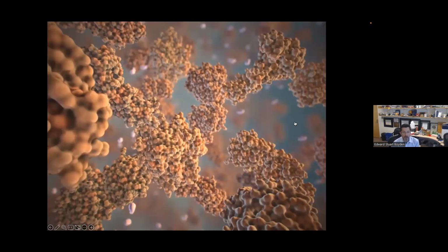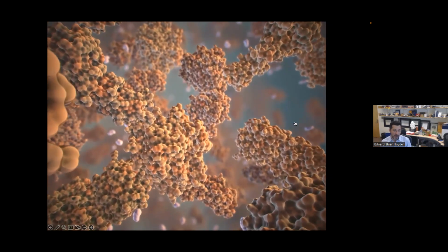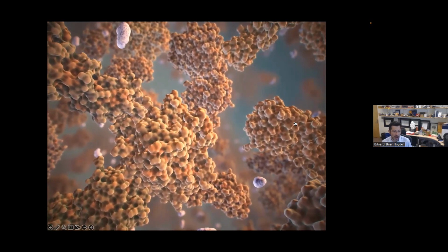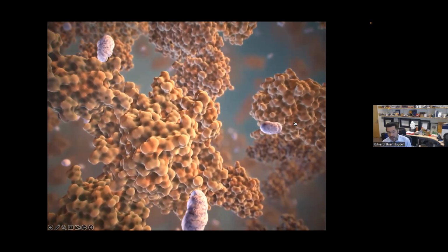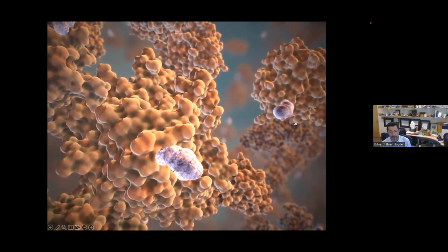The following 4 cartoons illustrate how the technology works. In all expansion protocols, our group, of course, developed the first one, but now many groups are developing variants that are customized for different purposes, like expanding bacteria or expanding bone. But all protocols more or less have the same kind of steps. In the first step, you attach some kind of anchoring molecule to biomolecules of interest. So in this cartoon, proteins are shown in brown and anchors are shown in purple. Basically, we're giving a little handle to each biomolecule type.